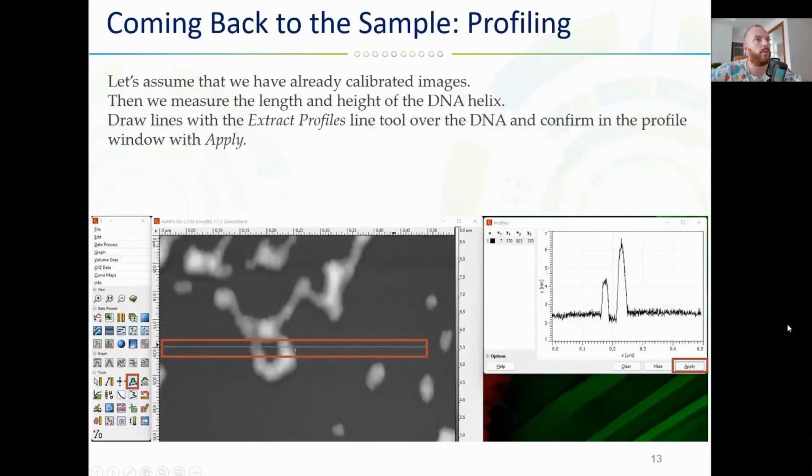So once we do this calibration, as I showed you, we will be able to make a profiling of any of your samples, like Blu-ray. We have Blu-ray samples and so on and so on. We calibrated everything. We do all the stuff, and we start measuring lengths of the samples that we want to measure, like for example DNA.